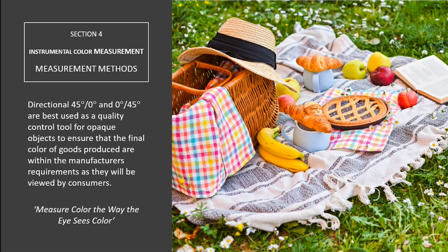So where would our customers use directional 45-0 or 0-45 geometry instruments versus transmission versus diffuse? Our customers who manufacture products and want to ensure the color quality of that product meets their expectations of what they want us to see are going to use reflectance 45-0 or 0-45, because that captures everything from the color to the surface appearance.